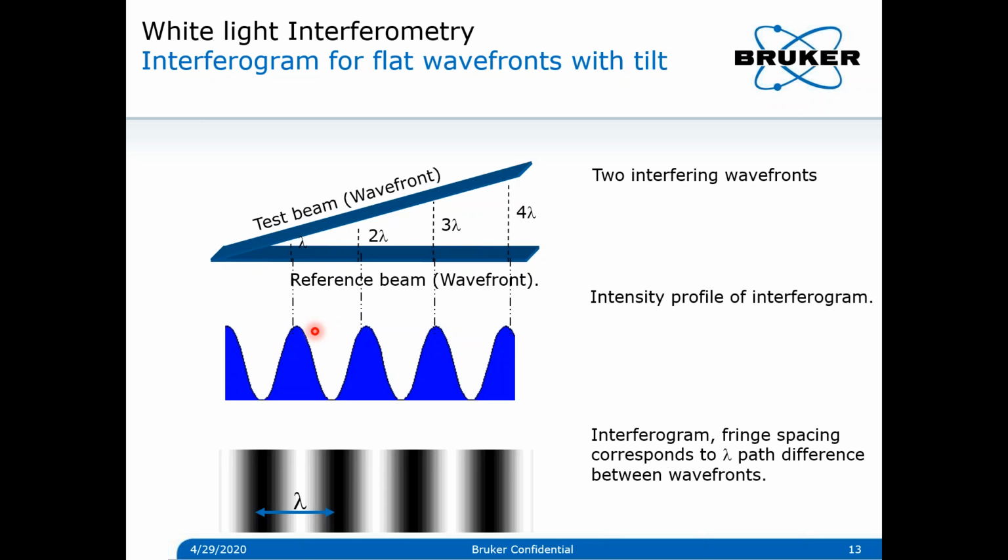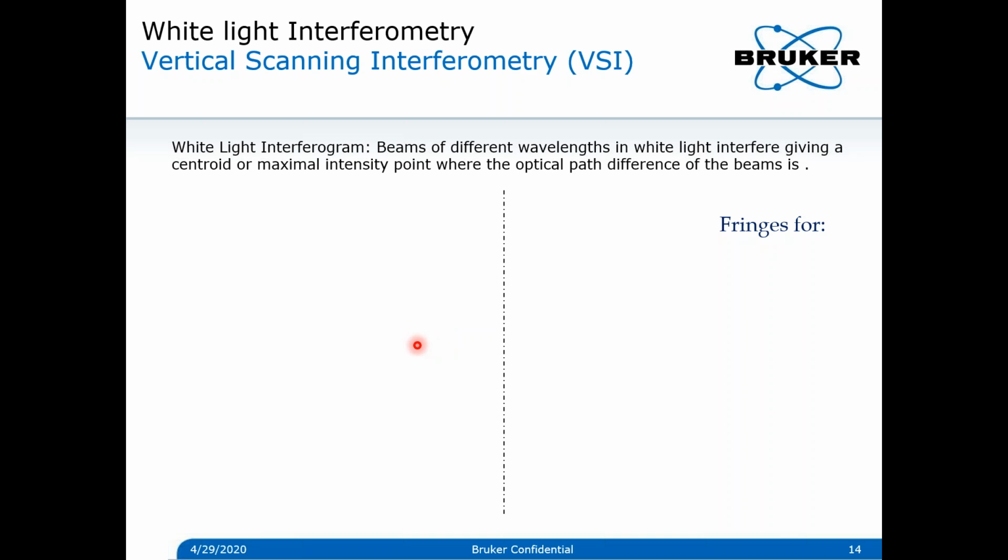Now, if you put two surfaces, two planes, in this slanted fashion, as you move along from this point to this point, since the distance is varying from the left end to the right end, you can find places where there are lengths of lambda, then another length of 2 lambda, then another length of 3 lambda. In those cases, since the interference criteria is satisfied over here, you can actually see fringes developing due to the interference.